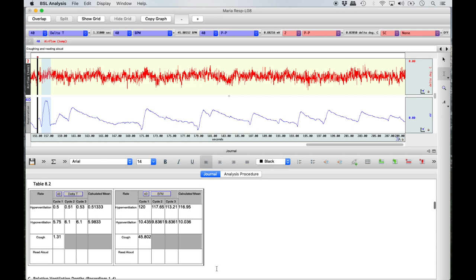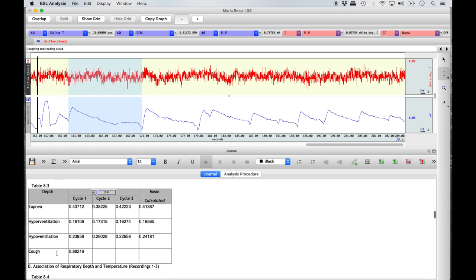The reading aloud condition follows immediately after the cough recording and should look like a series of high peaks that steadily decline until the next breath is taken. Using the I-beam tool, highlight from the valley just before one peak until the next valley just before the next peak — this represents one breath taken while reading aloud. Insert measurements for duration and breathing rate into both halves of Table 8.2 as previously done. Note that there is no row in Table 8.3 for this condition.